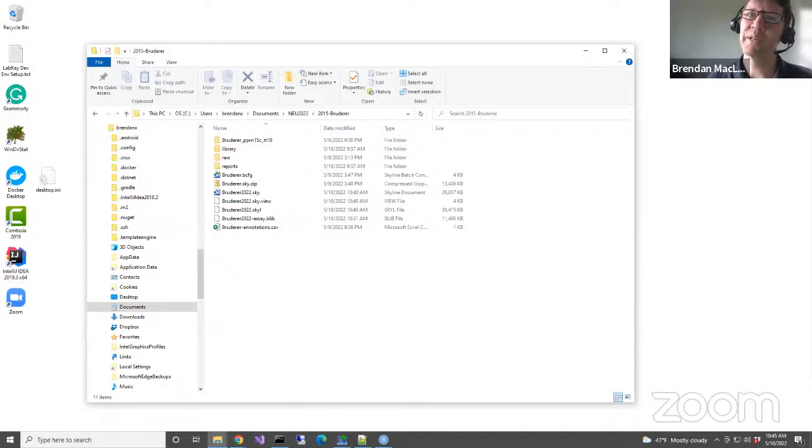But certainly, even if somebody acquires in profile mode, that just means they're saving the profile data. You can always get at centroid mode data. So we highly recommend that you use the centroided spectra in the analysis. That's definitely been proven over and over for us with Orbitrap data. Use the centroided data for analysis. But it's up to you whether you want to devote the disk space to saving the profile spectra. So that's that. But a lot of people in the McCoss lab frequently do not.